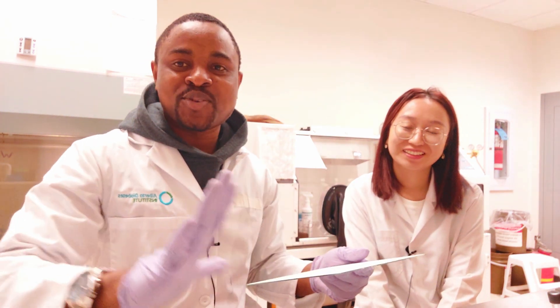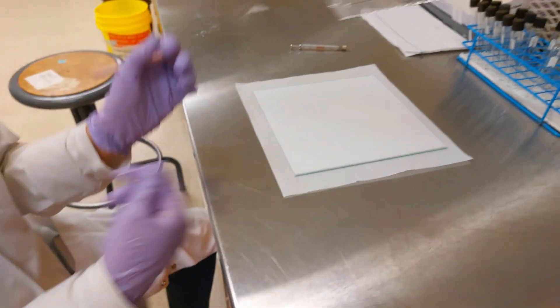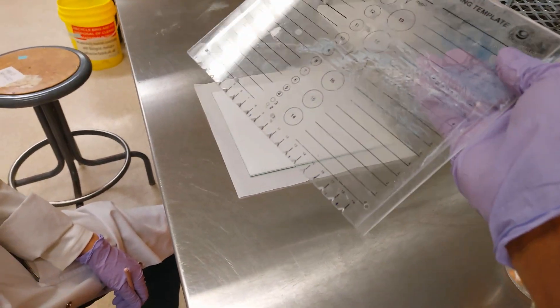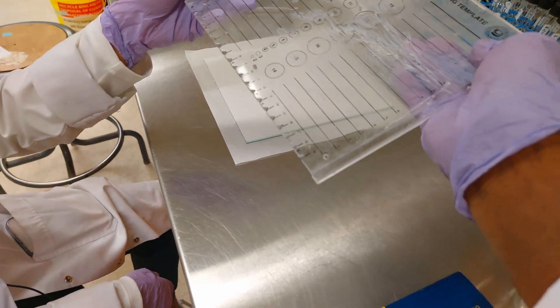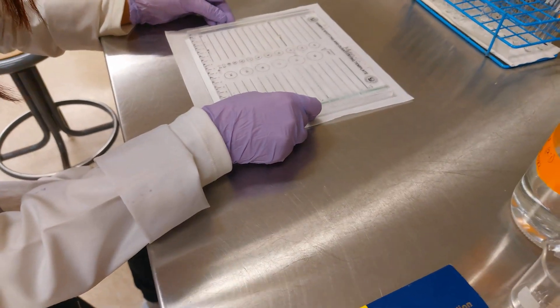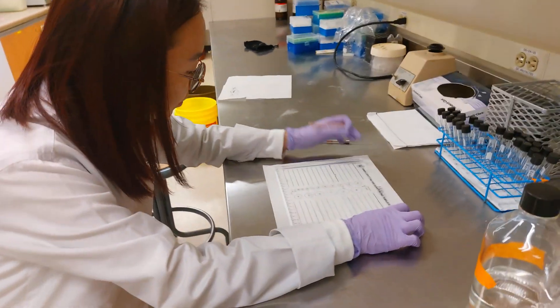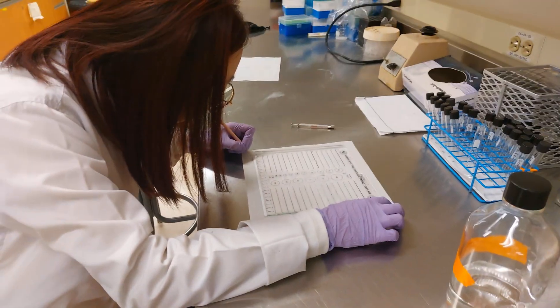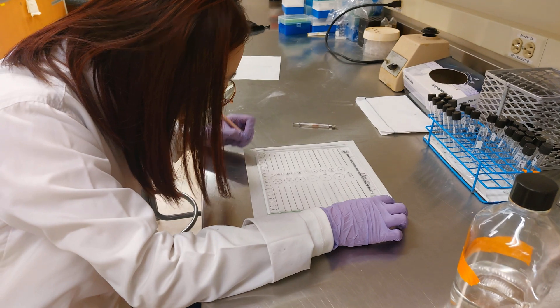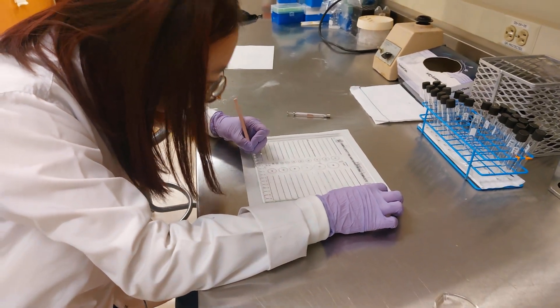She's going to put the lines and then do the spotting. We have a glass or plastic panel to use for the demarcations, because we need equal lines across the plate. One plate can take three samples, and we are doing three samples today. She can start drawing the lines — put the line at the bottom, and then put a line at the top as well.